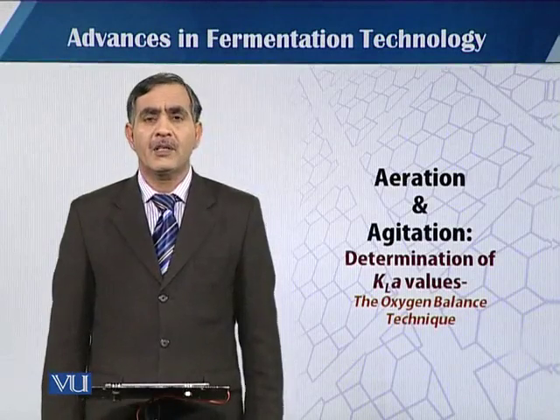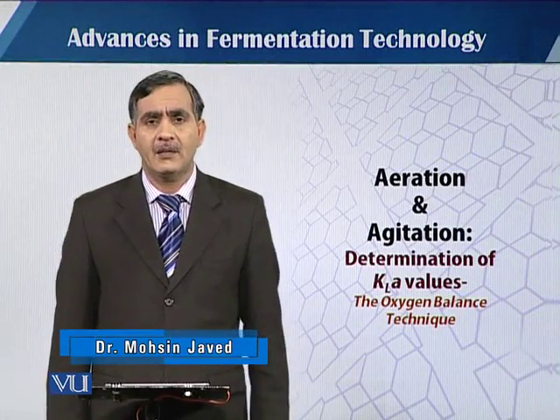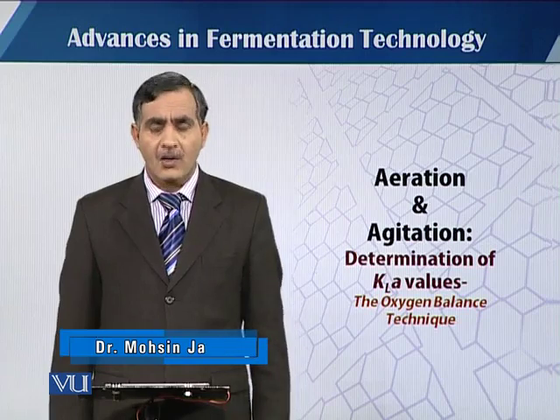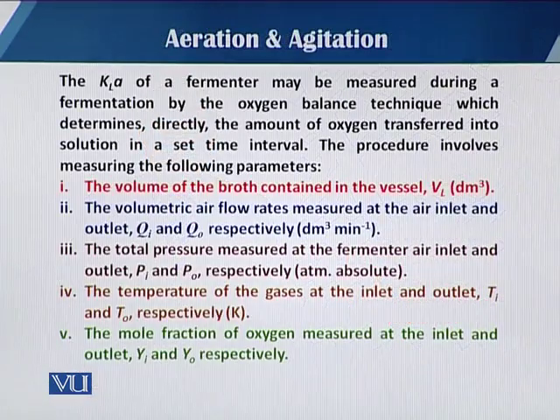In this module, we will talk about another technique to estimate the KLa, which is known as the oxygen balance technique. In this technique, the KLa of the fermenter is measured through the oxygen balance technique, which is actually a direct measurement of the amount of oxygen transferred into the solution in a set time interval.